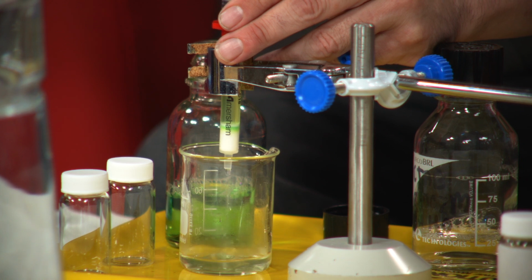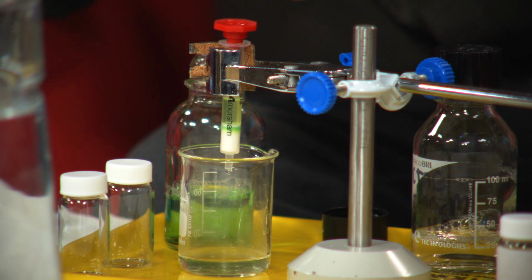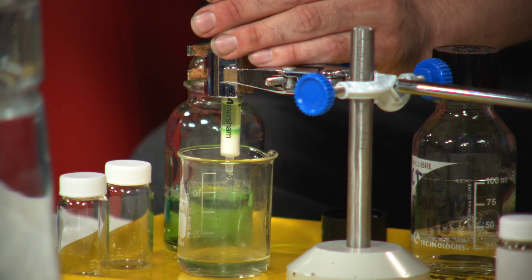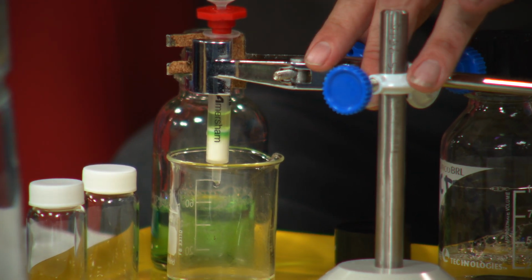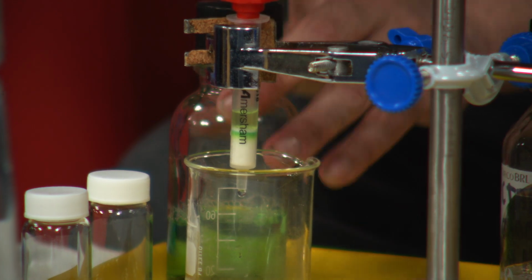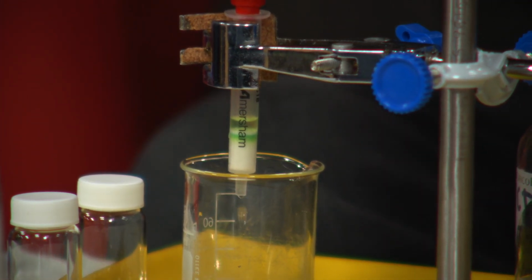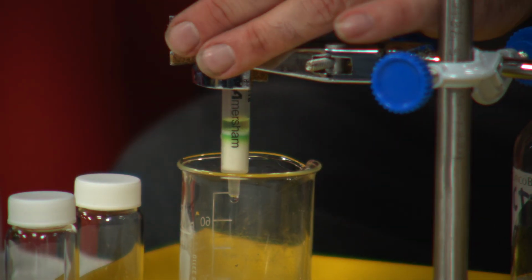Hopefully you might be able to see that that's concentrating a darker green colour at the top of the column. Might be easier, Nick, if you move away from the green background. Oh yes, that's good thinking. Okay, so just pushing it through, and then last but not least, do it one more time.